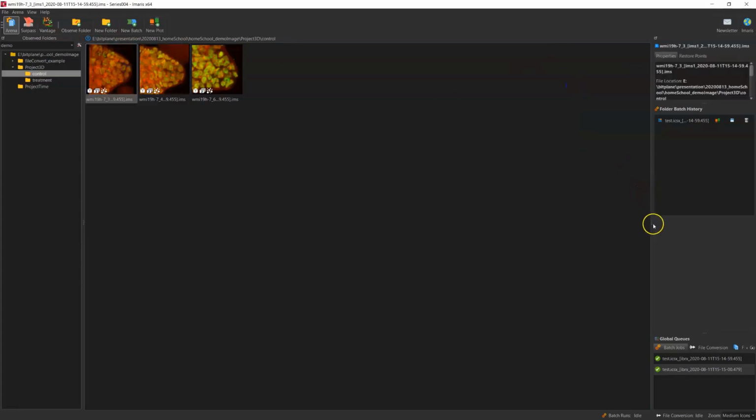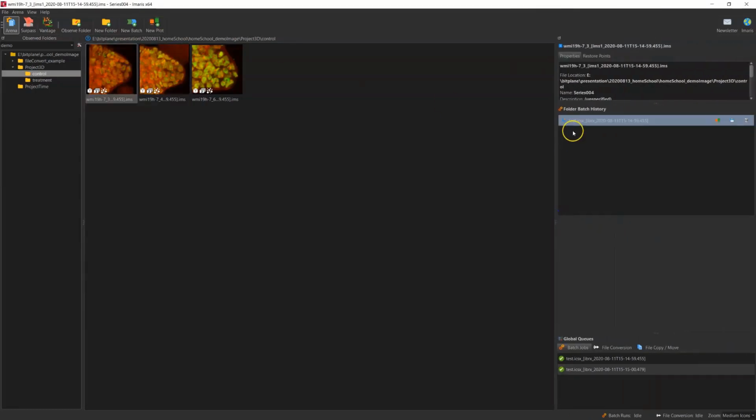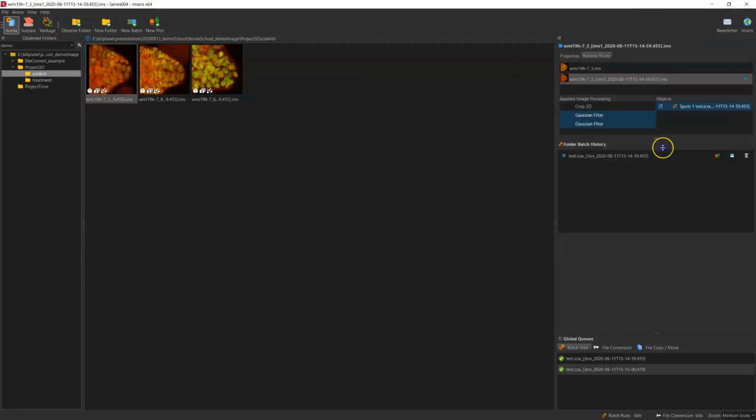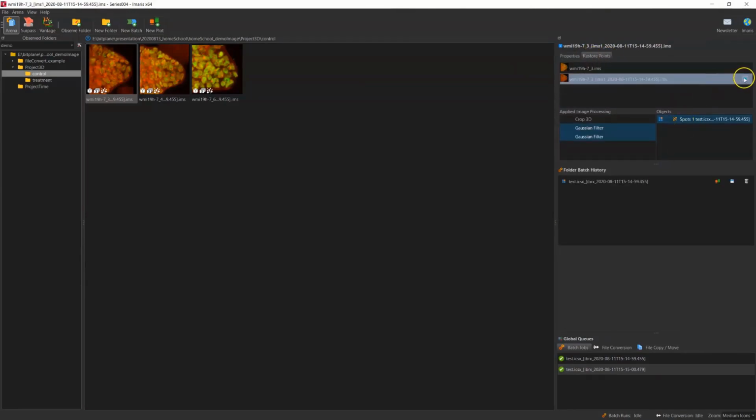And there are a few interesting things that you can do with it. First of all, there's restore points that allows you to restore the image back to the original copy. So let's say for some of the images you actually don't want to include the Gaussian filtered results. Then we can just simply click revert and it will revert back to the original image.